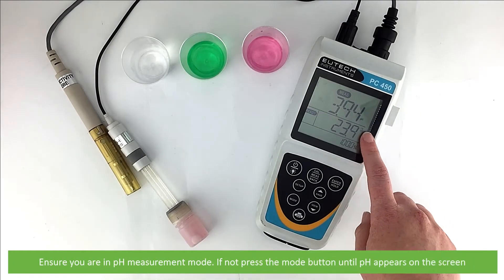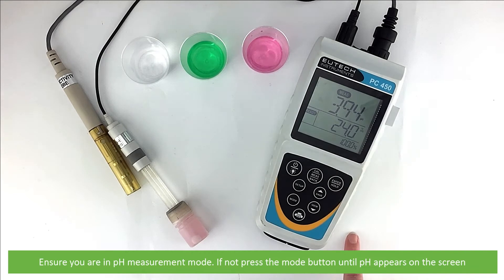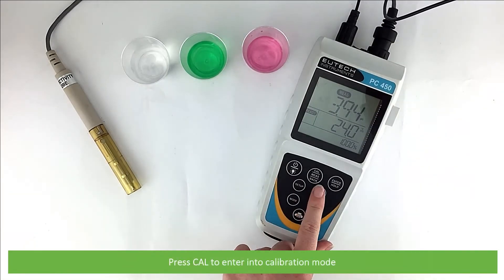Ensure you are in pH measurement mode. If not, press the Mode button until pH appears on the main screen. Press Cal to enter into calibration mode.